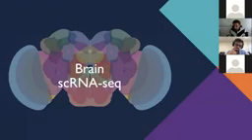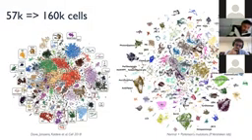So this is an overview of the different analysis we did on the eye disk. Now let's go to the brain. So this is another cup of tea. Here we are dealing with much more unknowns and a much higher complexity. We had published in 2018 this atlas of single-cell RNA-seq on the fly brain. And since then, we have expanded this to a 3 times larger data set, where now we can find many more cell types in the brain.